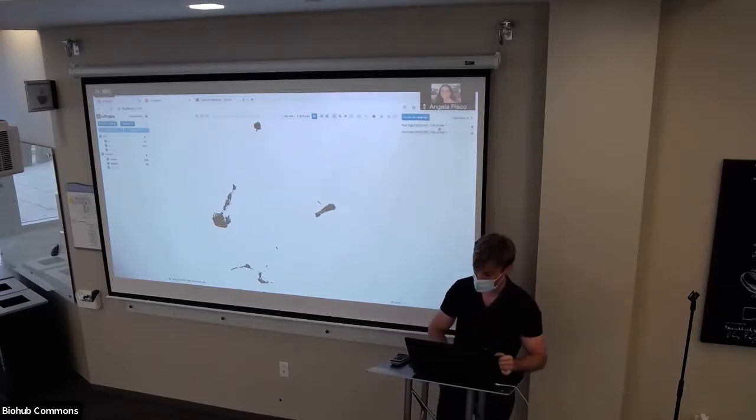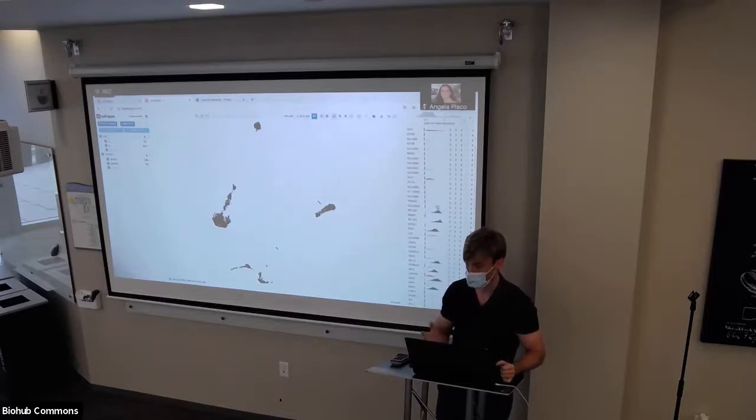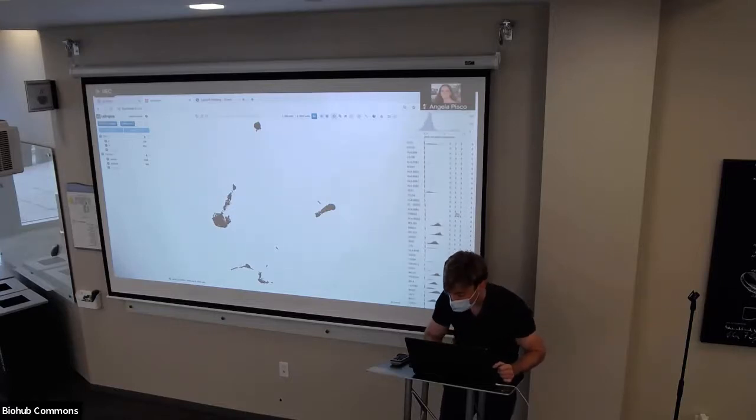The other thing with these genes that show up on the right here, which I only just discovered recently, is that you can actually show scatter plots between 2 genes. So let's say we have a couple genes in our set. Let's see, this one seems to be enriched. That one seems to be, okay, so these should have the same scatter.